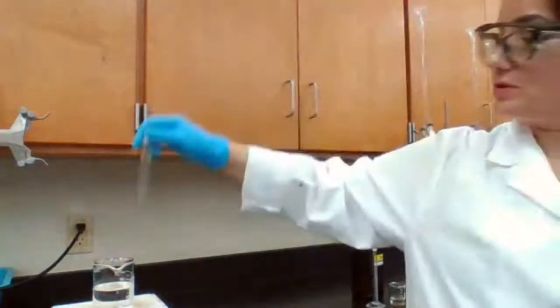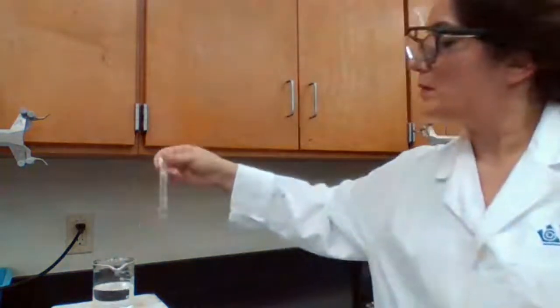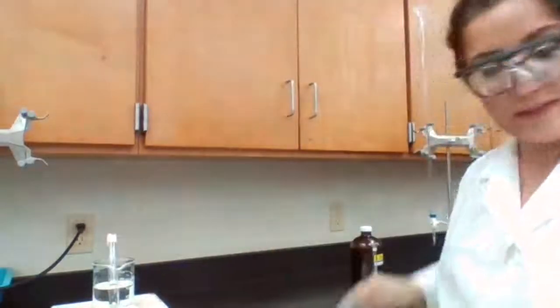So I wouldn't stop here. I'm going to continue heating, see what is actually happening. So it's a clear and colorless solution, so nothing happened to it.